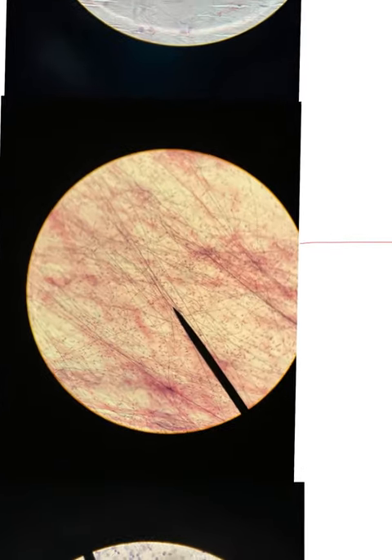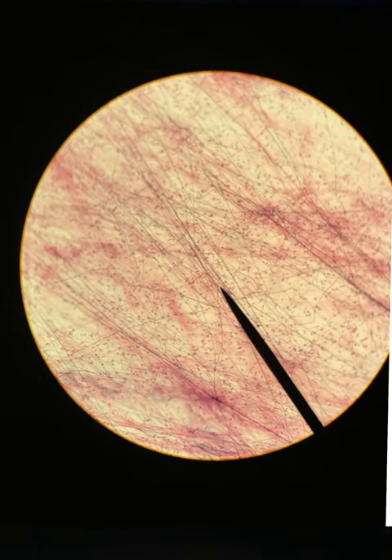Okay. Now, this is a type of connective tissue that is called a loose connective tissue. So what we've looked at so far is mostly dense connective tissue, with the exception of adipose and reticular. Those were both loose connective tissues. This is a loose areolar connective tissue, and it functions to support organs. One of the giveaways is these darker black fibers. You'll see that in the areolar connective tissue. And it supports and cushions your organs, so it's going to be found surrounding your organs.